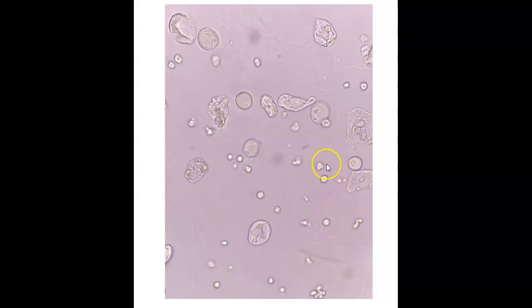But what are these guys? This one that looks kind of like an alien head. This one here, this here, this here. What are these? All right, so that's going to be your mystery. Tell me what you think they are, and that's going to be in your lecture test code as well.